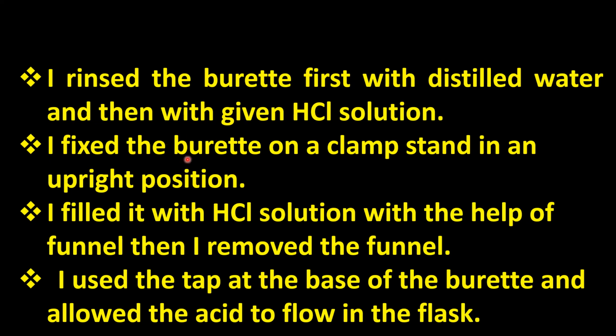Then I fix the burette on a clamp stand in an upright position as I have shown you in the picture as well. And I will also clarify all this at the end of the lecture. Then I filled it with hydrochloric acid solution with the help of a funnel, and definitely when I fill the burette, I have to remove the funnel. I use the tap at the base of the burette and allow the acid to flow into the flask.